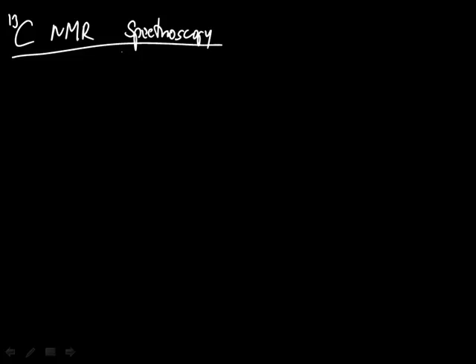If you think about proton NMR spectroscopy, it basically gives us information about a carbon skeleton only indirectly, by looking at the protons that are attached. And since most of the action is actually happening on the carbons themselves, the question is, could we look at the carbons themselves directly? And the answer is yes, we could, and that's what carbon-13 NMR spectroscopy is useful for.